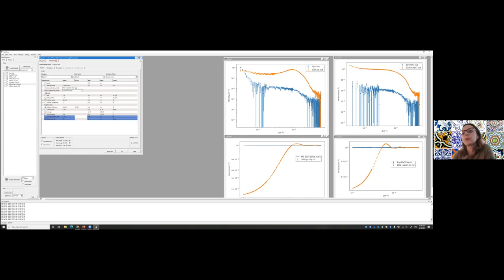On the bottom, what I'm plotting here is just the structure factors for the two. Well, salt can interact with the charges on the protein and do a little bit of shielding of the charges from each other. So without salt, I guess there should be more electrostatic interactions between the different protein molecules to each other.